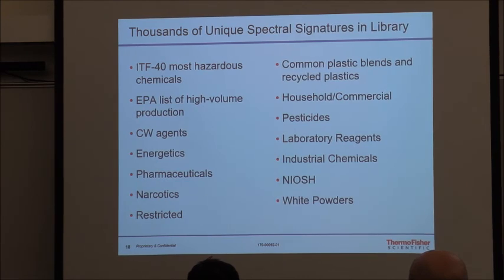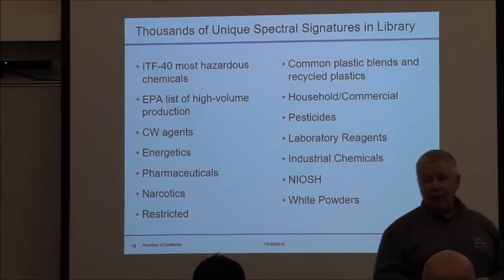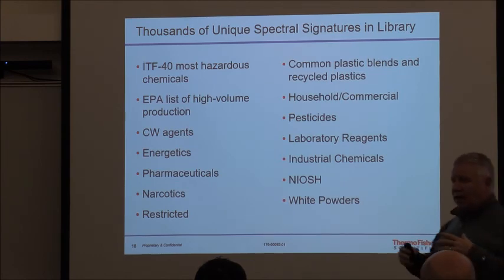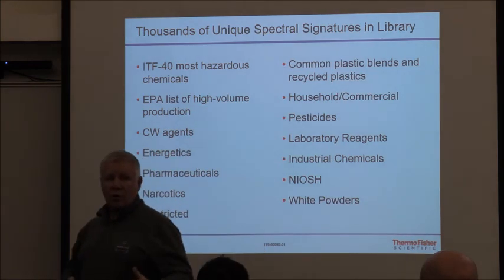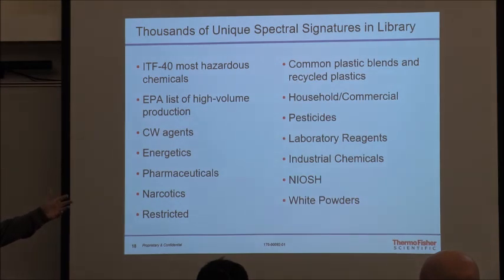So if you were to get something and you were to have thiodiglycol, it would say that, and then it would say it's coming out of the CW agents. Like I said, you'll be able to access more data and more information on the device as well. I'm going to show you how to do all that. That is designed just to give you some assistance because we know a lot of people aren't chemists or don't have chemistry training. So it's that initial moment: all of a sudden we go downrange and we get a hit or a result on something. And where do we go from here? What is this telling me?